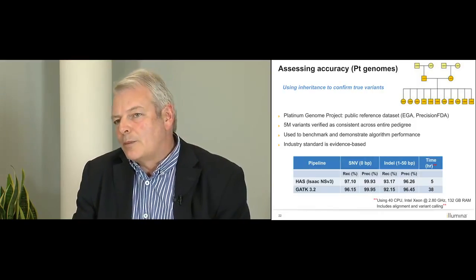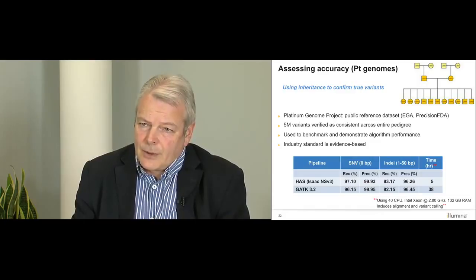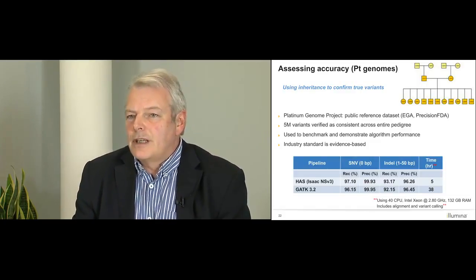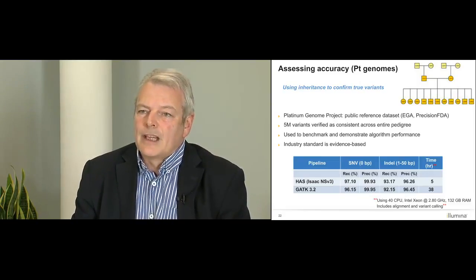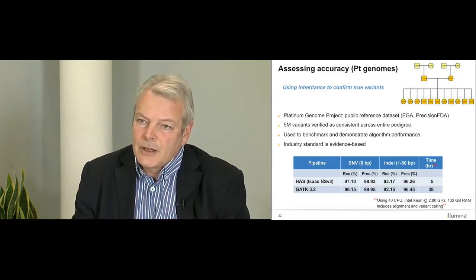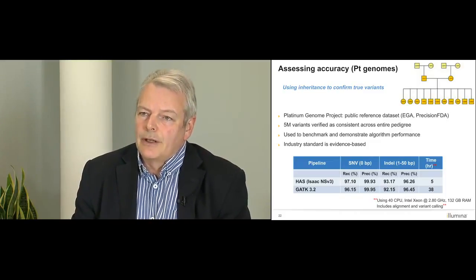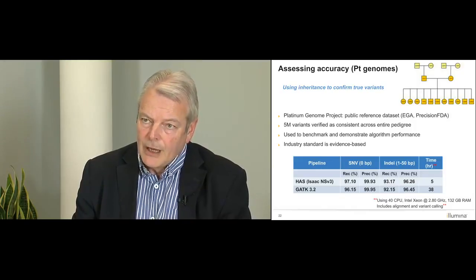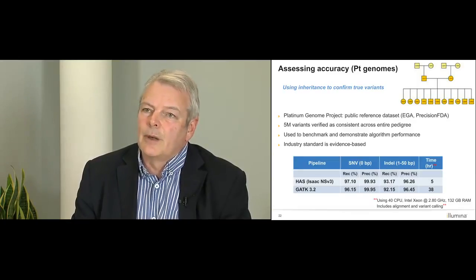But the other very important point about this is that the reason the HiSeq analysis software suite was written was in order to cope with the challenge of scale, because you can see here that a whole genome is actually analyzed in 5 hours as opposed to 38 by the GATK suite of software. And this becomes extremely important when we're working at scale, which I'll just touch on a bit later. And these performance criteria were measured on an equivalent hardware platform.